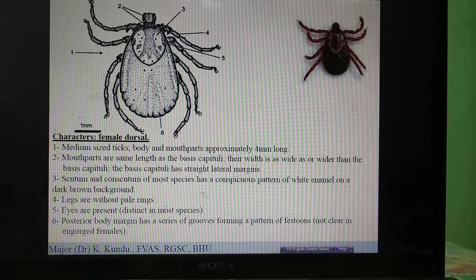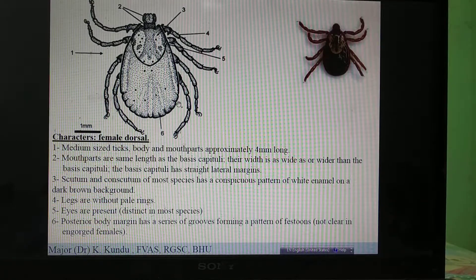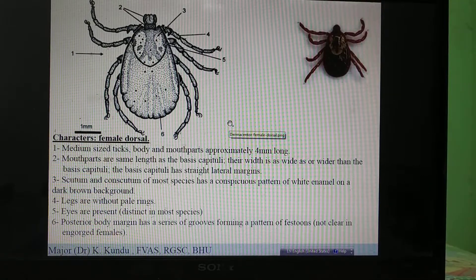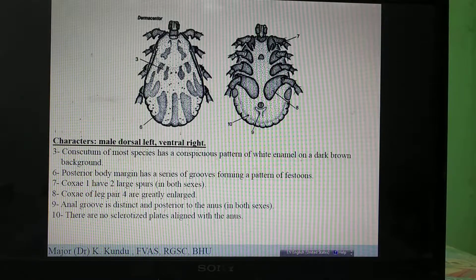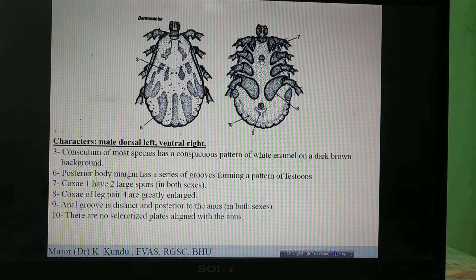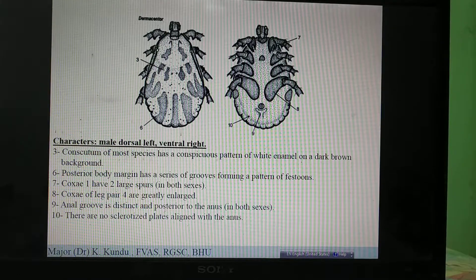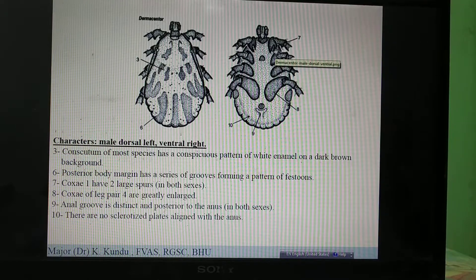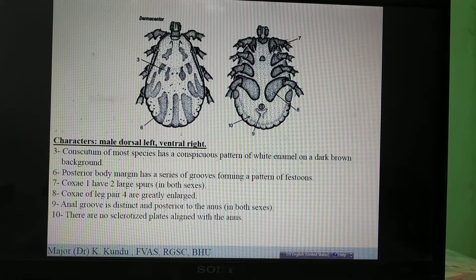The festoons are present in Dermacentor. In case of males, the first coxa has two strong spurs, similar to Hyalomma. Amblyomma has a single spur, Hyalomma has two spurs, and Dermacentor also has two spurs. So how will you differentiate between Dermacentor and Hyalomma?